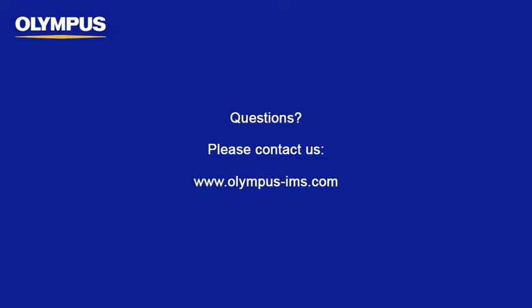In this instructional video, we have covered advanced acquisition within the Olympus DSX series opto-digital microscopes. We hope this video has been beneficial, and we invite you to contact us directly with any questions.